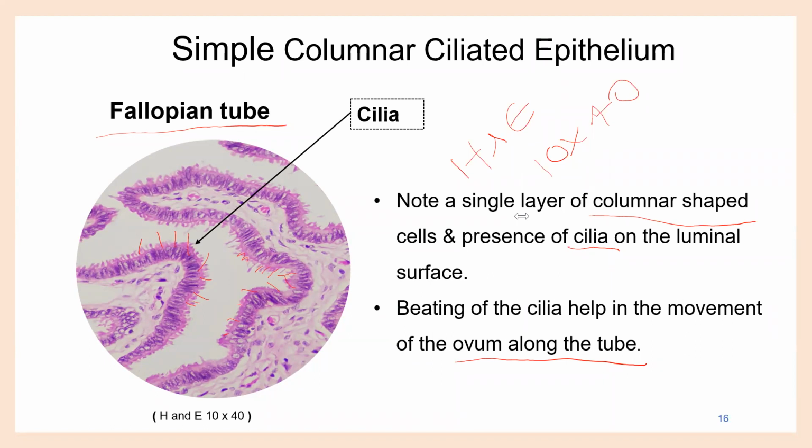How do I find whether it's low or high magnification? By the things that you can see, right? If you can see the wide range and smaller nuclei, smaller structures, that means low power. If the cells look really large, then it is high power.